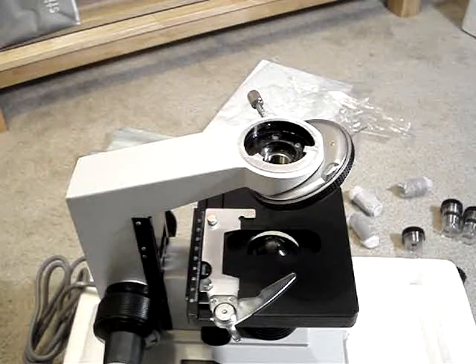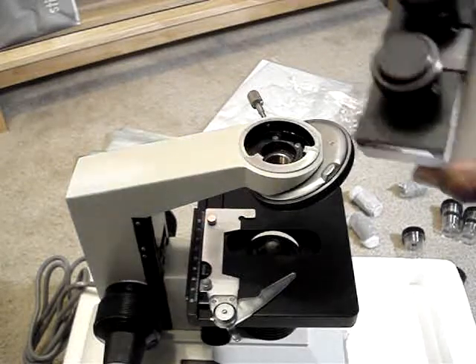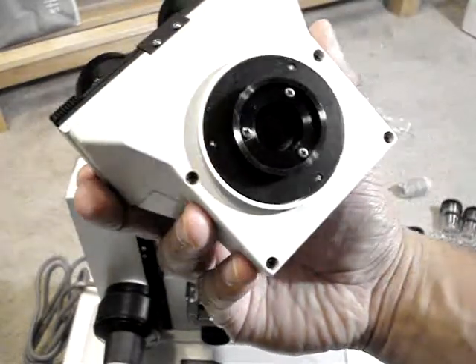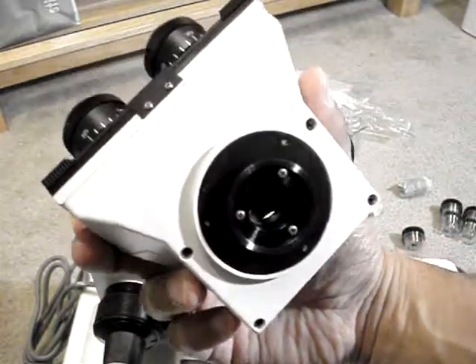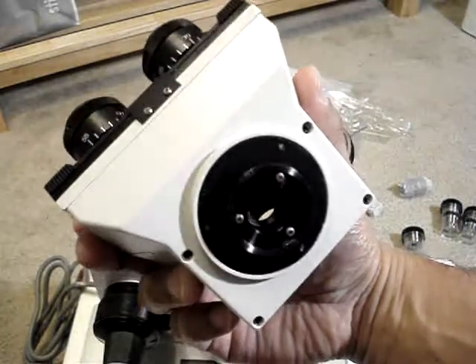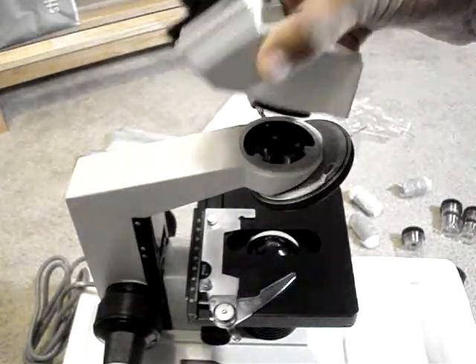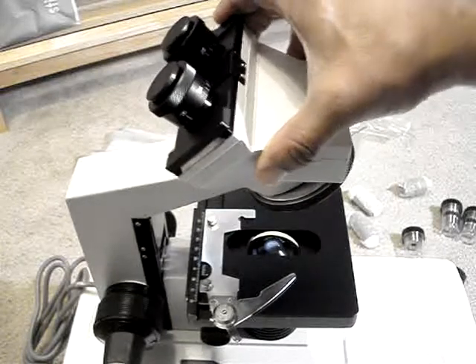I wanted to share with YouTube viewers about a Celestron microscope that I recently purchased. If you're one of those people that are interested in science and like to view things through a microscope, then this is definitely a good piece of equipment to own.